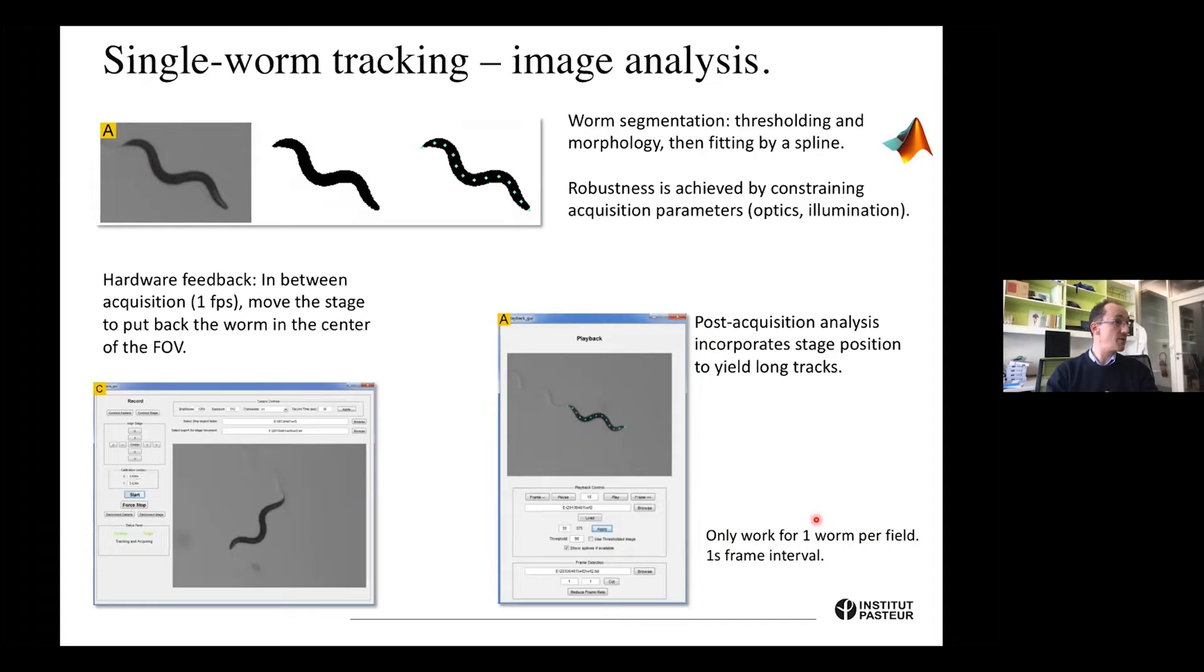Then to get the position, simply take the center of mass and make sure the stage is moved so that the center of mass is in the center of view. You can do that at one frame per second. If you just have one worm per field, it works. This gives the output. Again, you're tracking the position of the stage, not so much of the worm, but you get this. You can follow the trajectory of the worm centroid. But since you have the shape, you can also follow what the nose does, super important for C. elegans. If you have seen this sinusoidal pattern, wild type worms have this scanning behavior of the head that you can see here. Then you can start playing with mutants. For instance, that's uncoordinated-9 mutants. Now you see the trajectory, but in particular, the movement of the head is very different.